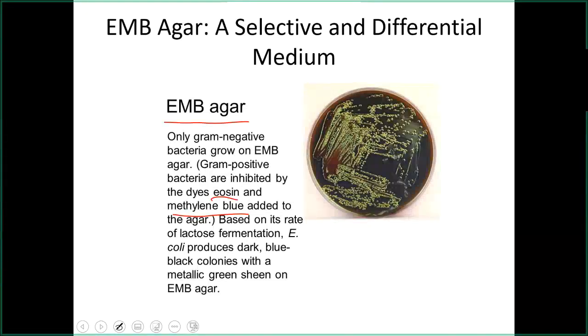Right? And frequently gram-negatives are pathogens, serious pathogens, and so if there's concern about the presence of gram-negatives in a particular setting, in water, in food, the environment, where people might be active, using this type of medium would determine if they're there and might even help you figure out what kind they are, because not only is it selective, but it is differential. And it differentiates as well.